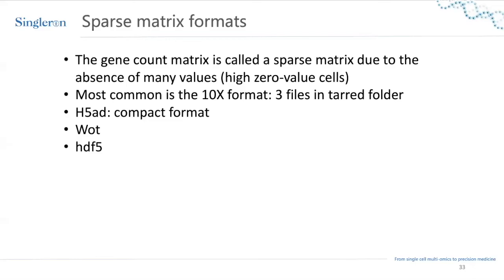And yeah, this is where our journey stops. So now you have your count matrix and you can sit and play around with it. As I said, there are many tutorials that explain to you what to do with these count matrices, how to normalize them, what type of QC to do on them, and then you can go on and just visualize, you can annotate. So as I said, you can go out and try it for yourselves, or you can wait, and maybe we will have a training on that as well in the future.